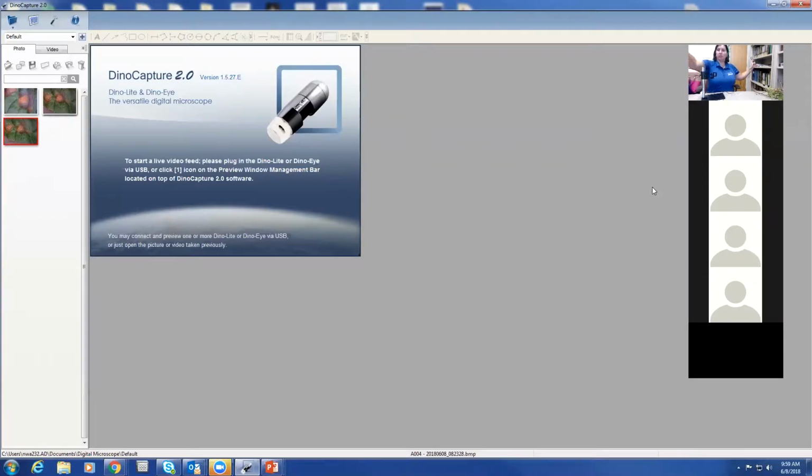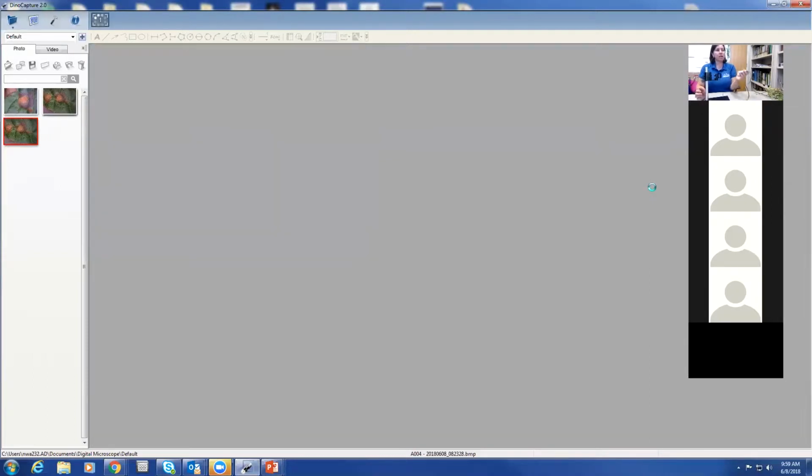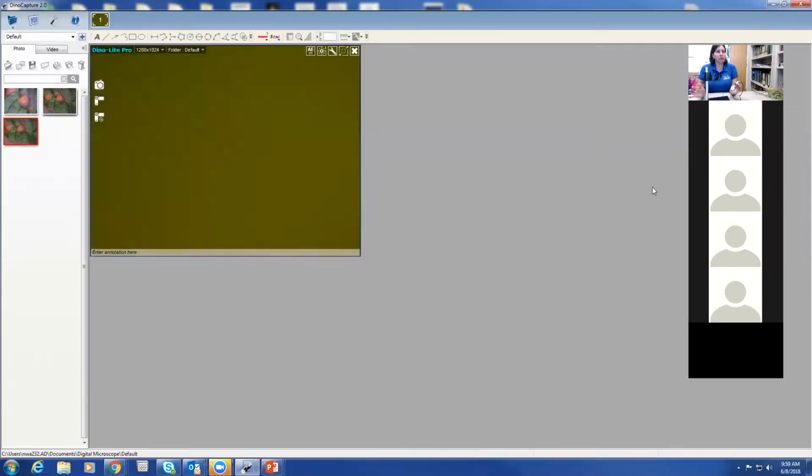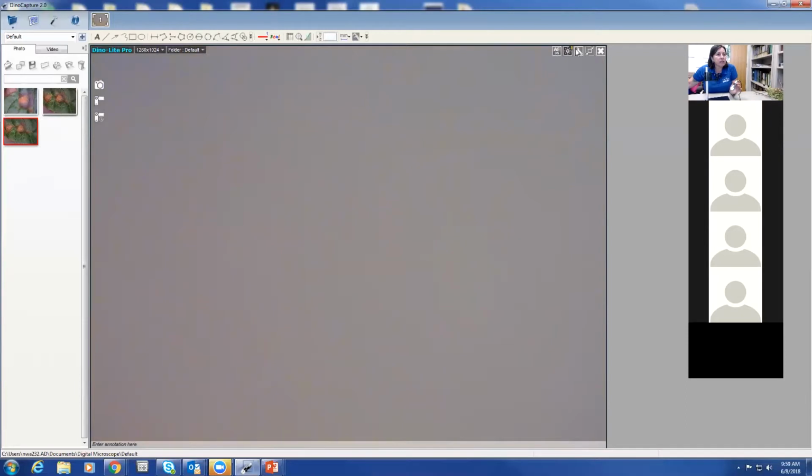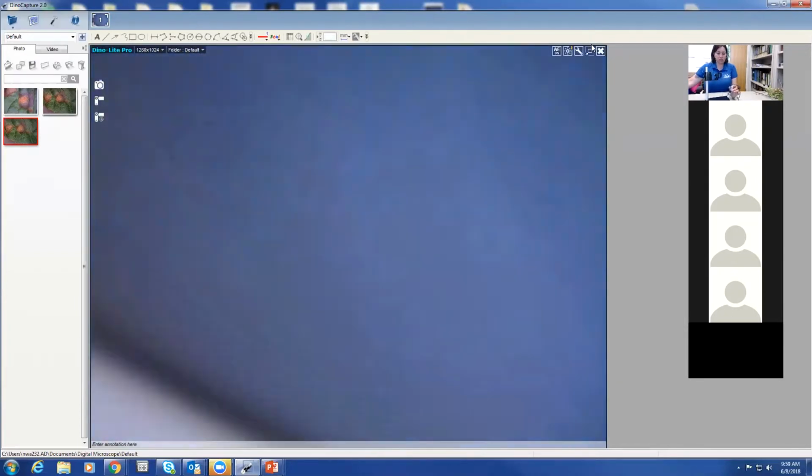Kim, I need your handy dandy help to plug that into that USB. I've got some USB ports that are not working. Okay, so your DinoLite now is going to, so I'm just waiting, it comes on, there it is live. Okay, you can expand your screen by this little cursor here. Can you see my cursor there? Okay, you can expand my screen and this gets you your DinoLite.